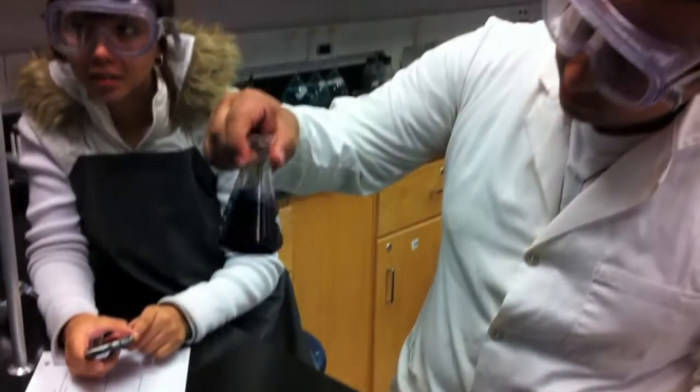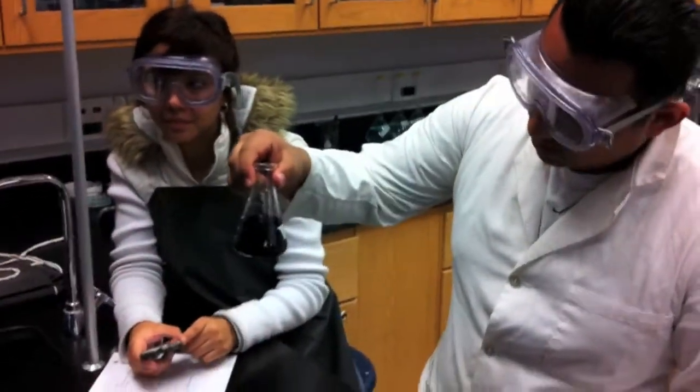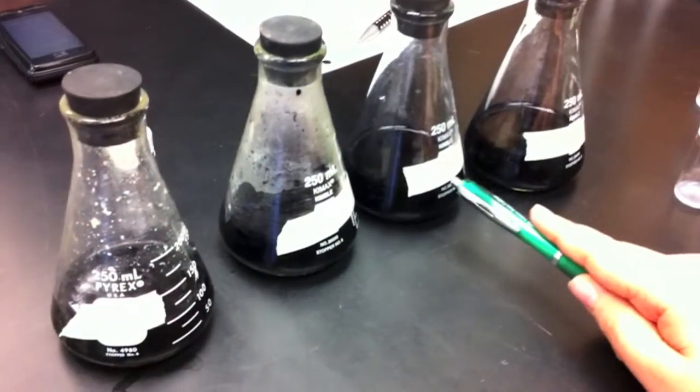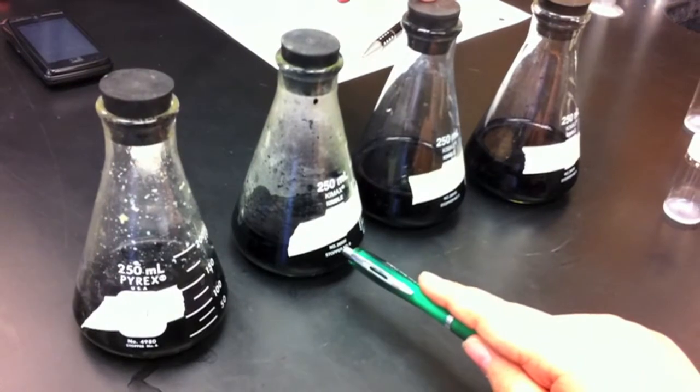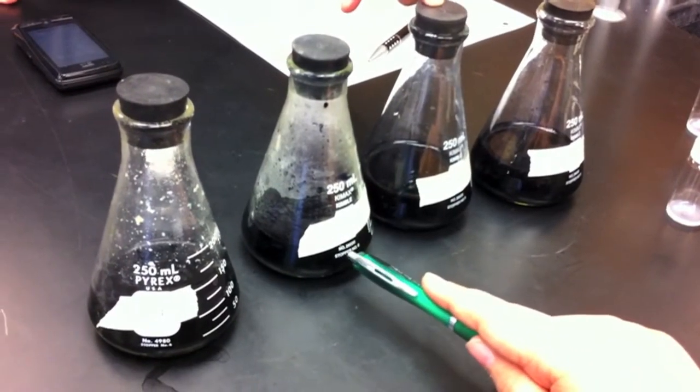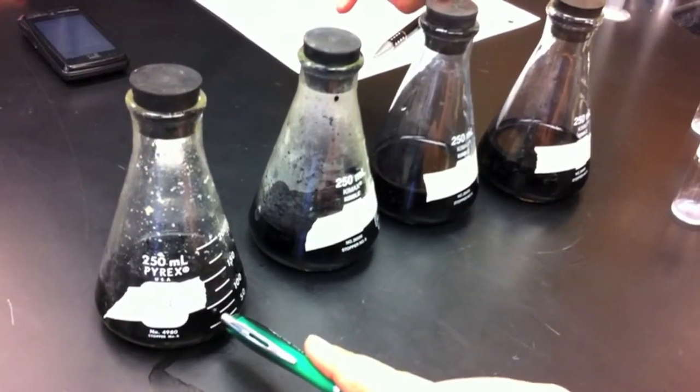Oh, that was fast. Wait, what happened? I missed it. This one is our control. This one was when the Erlenmeyer was heated. This one had the Erlenmeyer dirt cold. And this was the one that had acid mixed in.